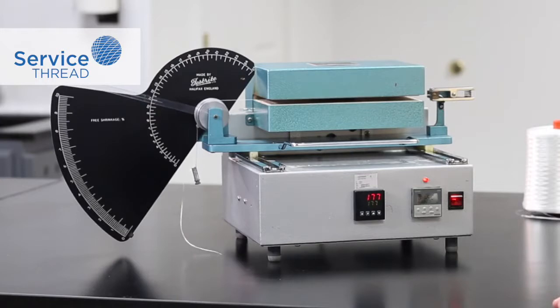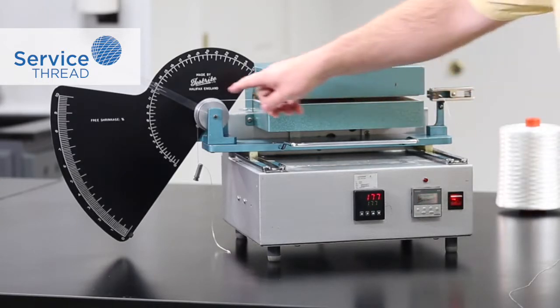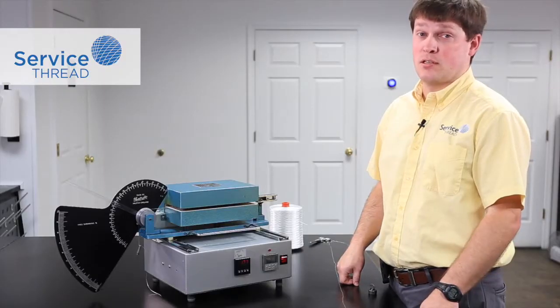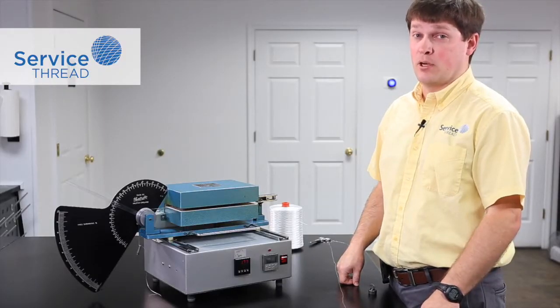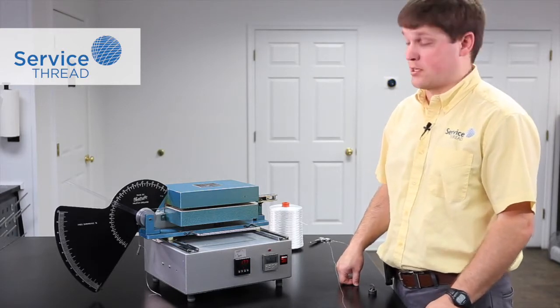As you can see already, a lower weight gives you a higher shrinkage. The shrinkage for this sample is about 12.6 percent. So you can see that a lower weight really does make a huge difference as far as the results you'll get doing a shrinkage test.